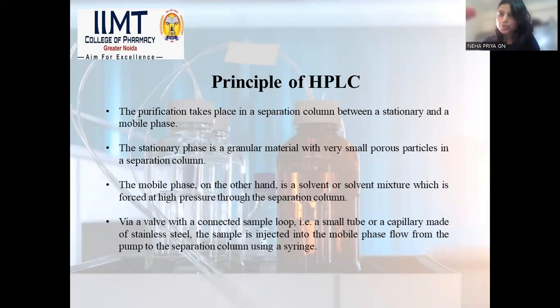With the help of spectroscopy techniques, that is UV or IR, it will give us a graph between absorbance and retention time. Take it as an example. I have already mentioned A as glucose and B as sucrose. For example, on the graph, the retention time of glucose is 6 and of sucrose is 7. If I have a graph showing a retention time of 7, then I know that it is sucrose, and by this I can identify my compound.